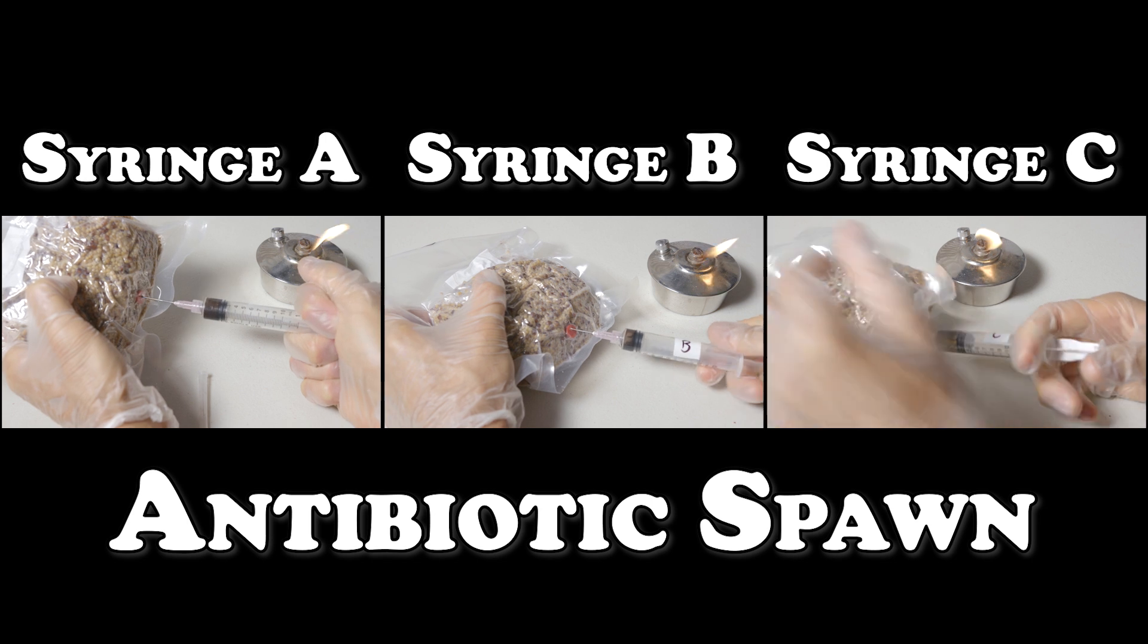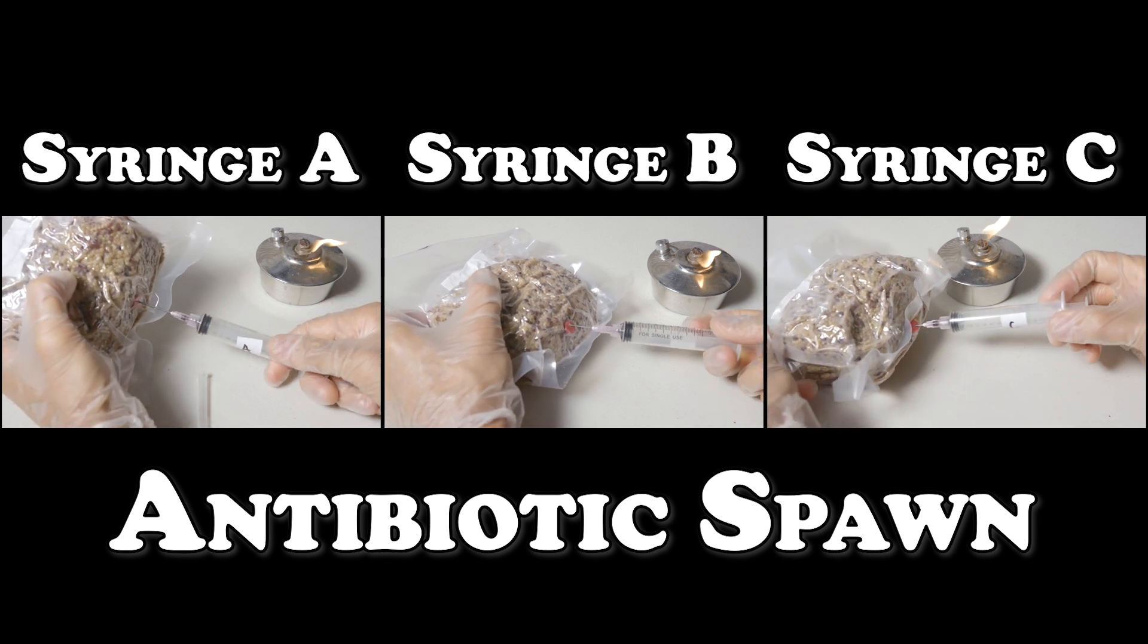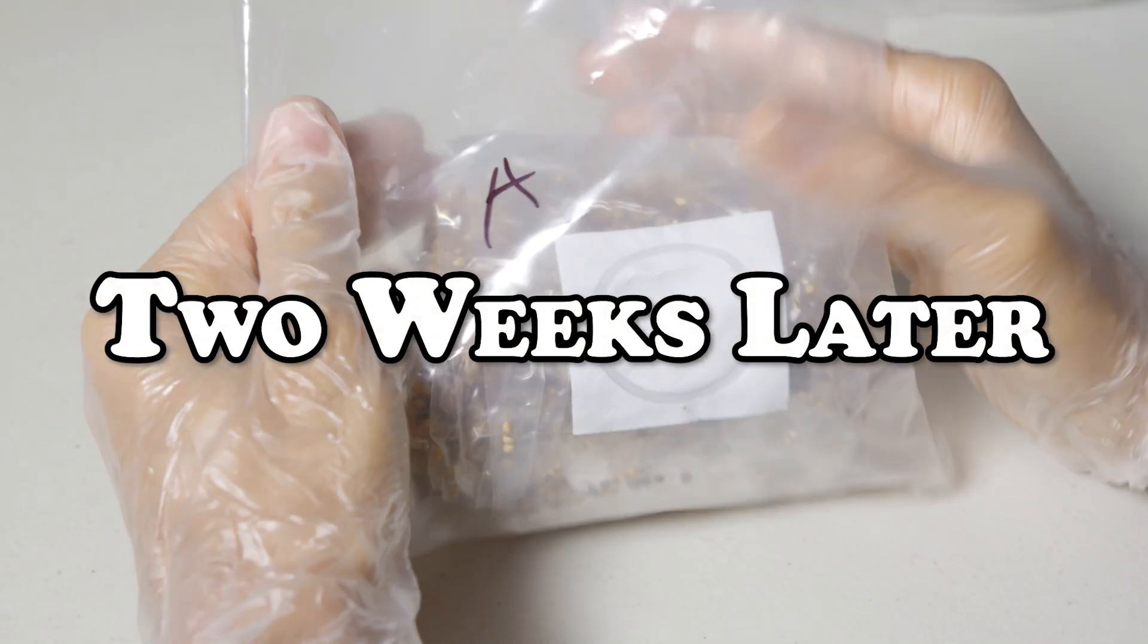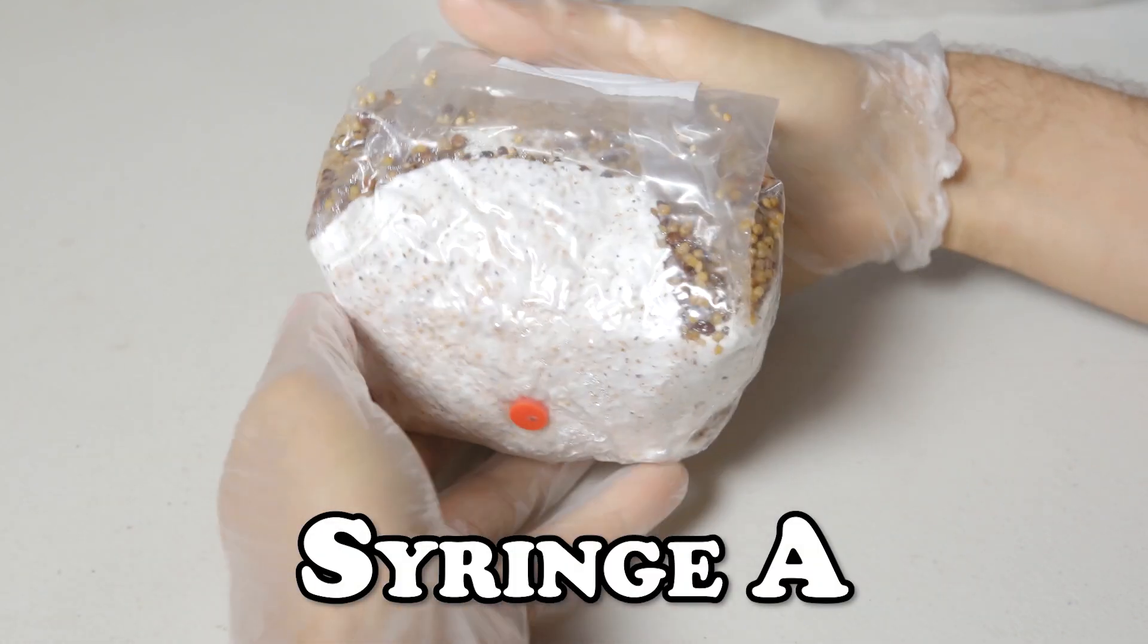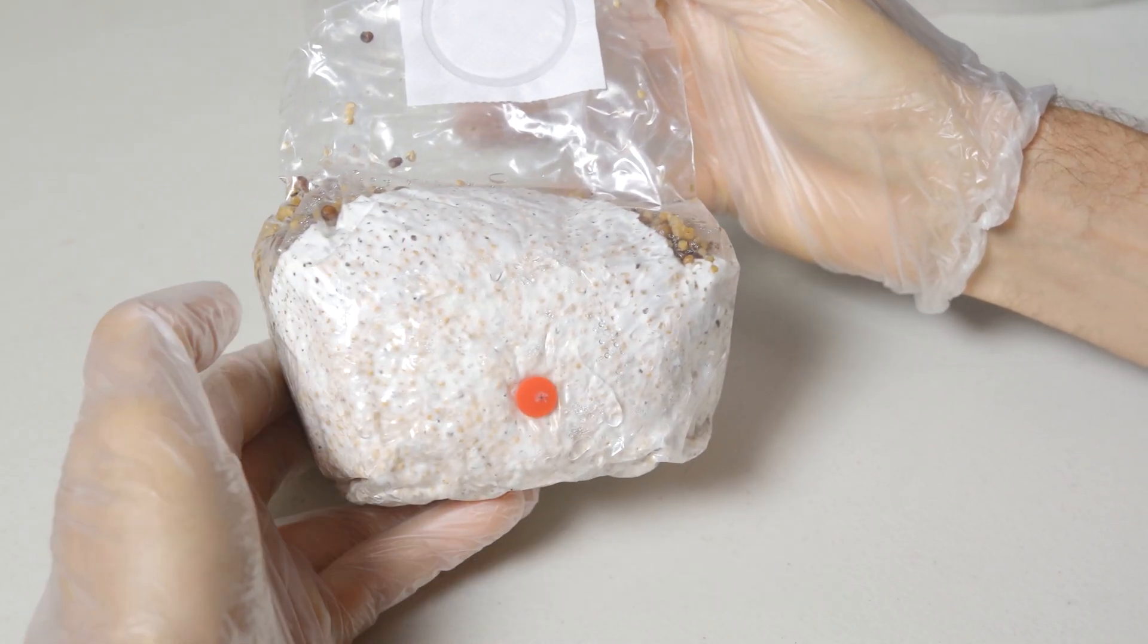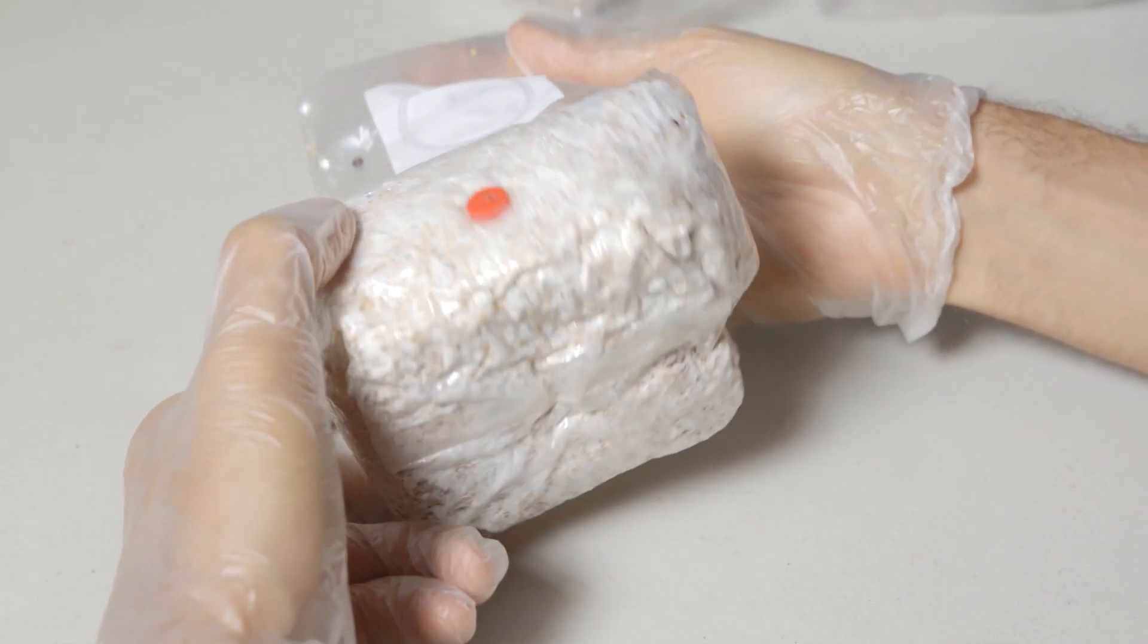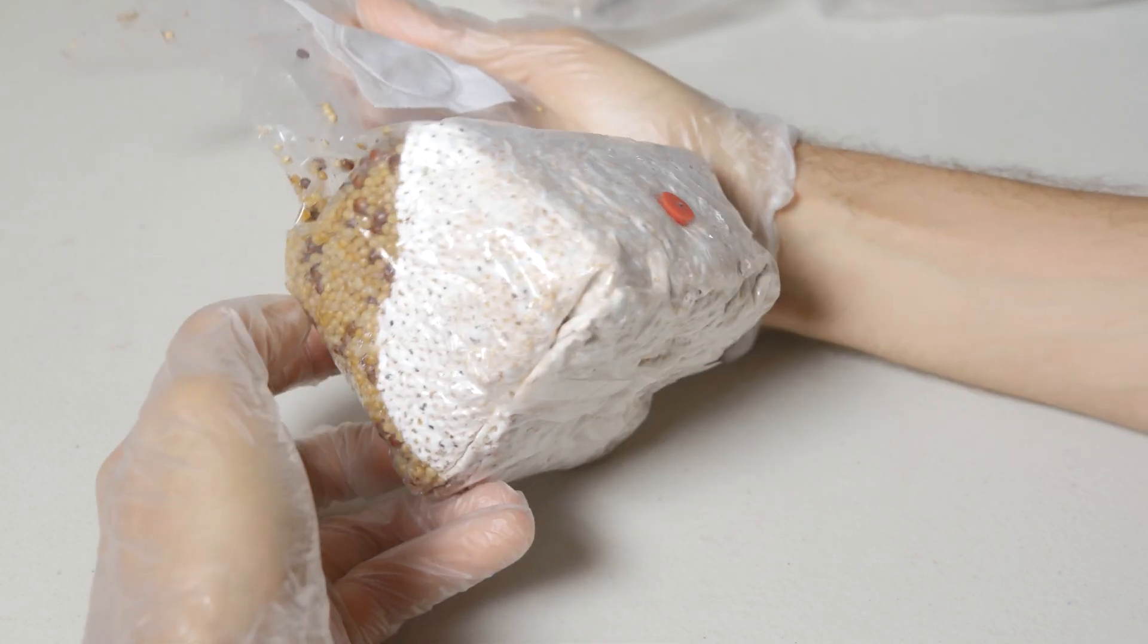Here we are inoculating the remaining spores into the treated grain, and for the sake of time we'll jump right ahead to two weeks after inoculation. We'll again start with bag A. As expected with this syringe, the mycelium is growing nice and healthy. We have that thick white mycelium growing from the inoculation port and it's ready to be mixed up and incubated until it's fully colonized, maybe in about four to six days time.